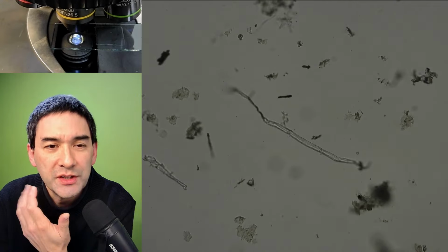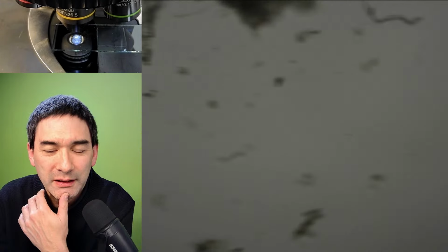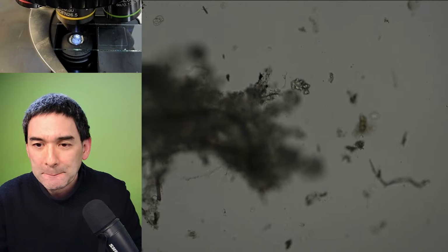Honestly, I have to tell you, this is not such a nice sample because I had already collected it from my washing machine. I found so many; it was completely full. So I would say it's probably a sampling thing.